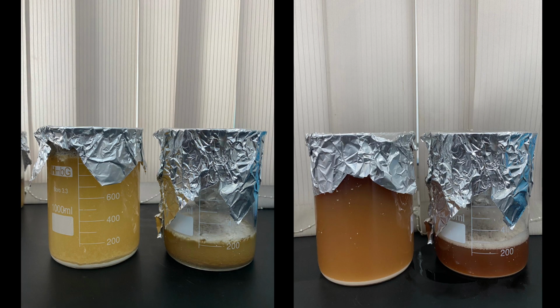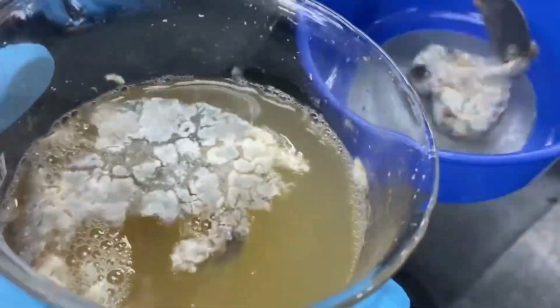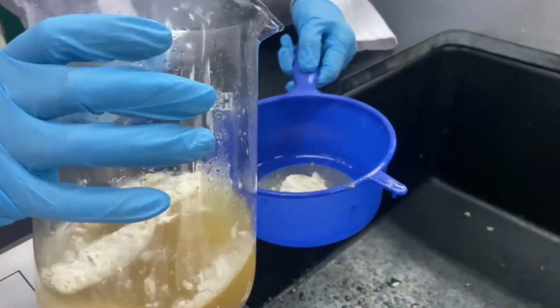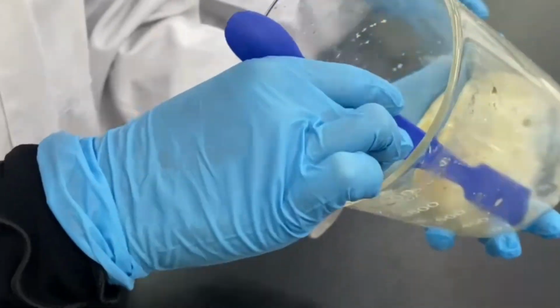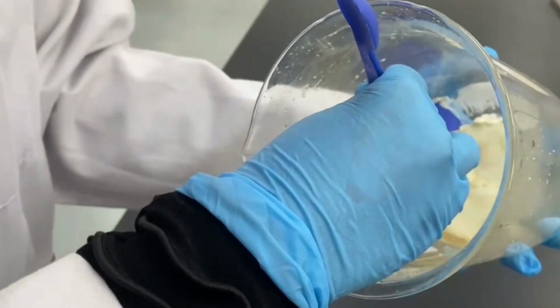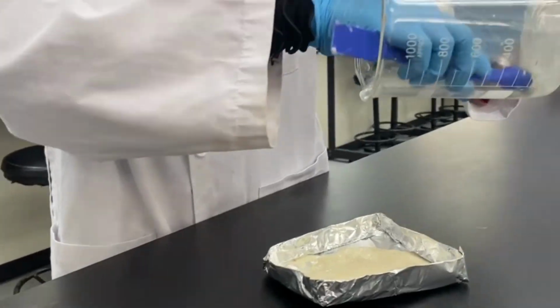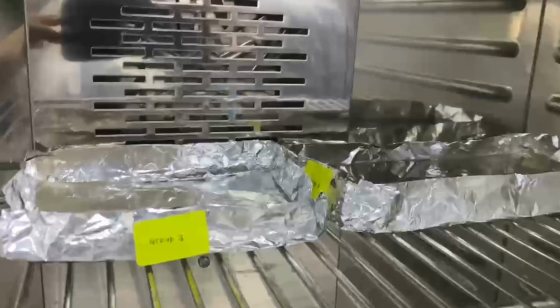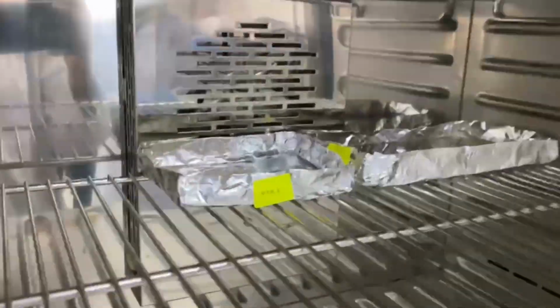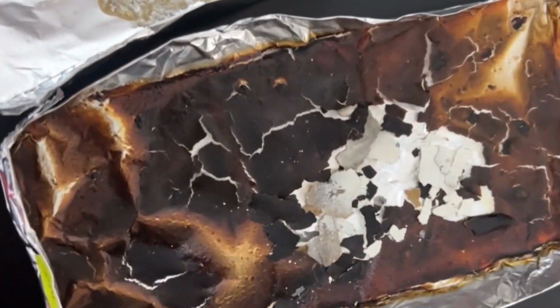Afterward, the starch appears at the bottom of the liquid. Then, to get the starch, the fungi was removed. The liquid was strained, leaving the starch at the bottom. The potato starch was transferred to aluminium foil using a spatula. Then, it was placed in an oven at a temperature of 50 Celsius to be dried. After 3 days, it resulted in a light brownish lumpy powder.